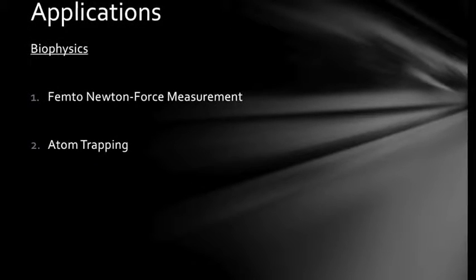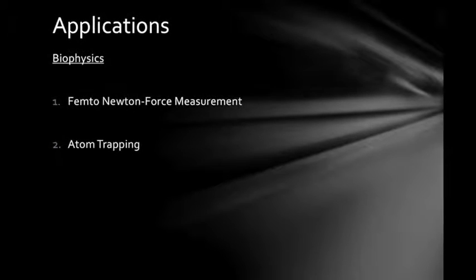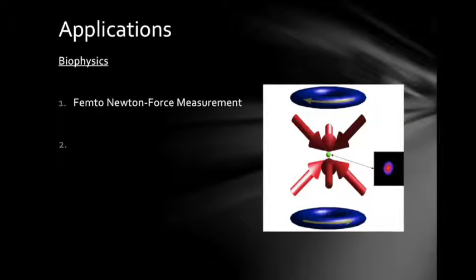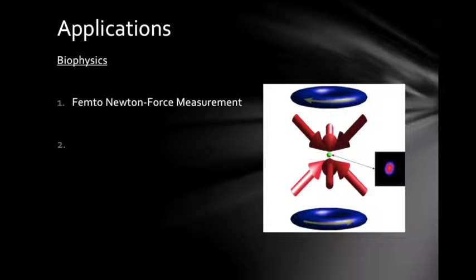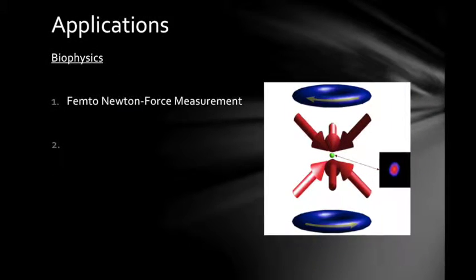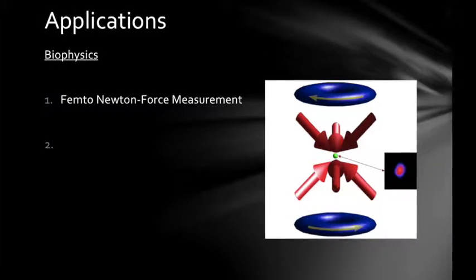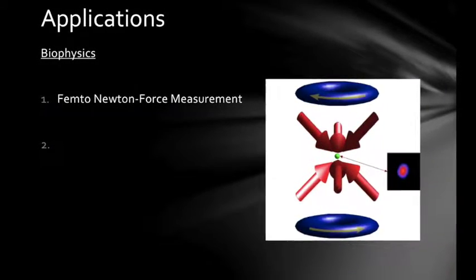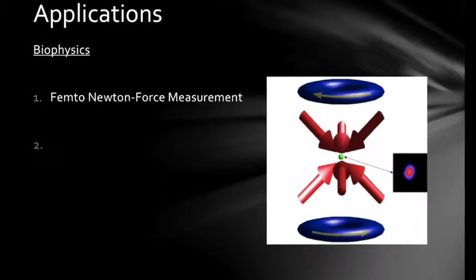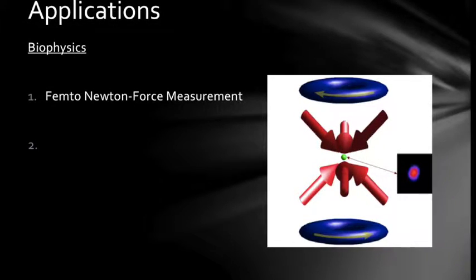In the fields of biophysics, optical tweezers play a part in femtonewton force measurement and atom trapping. Several generations of technological improvements and refinements have brought optical tweezers to their present-day state, a cornerstone technique in the life sciences, employed for both micro-manipulation and the accurate tracking of piconewton forces generated in biology at the subcellular level. The manipulation and force sensing using optical tweezers is contact-free and sterile, since no foreign objects are in touch with the often delicate sample.